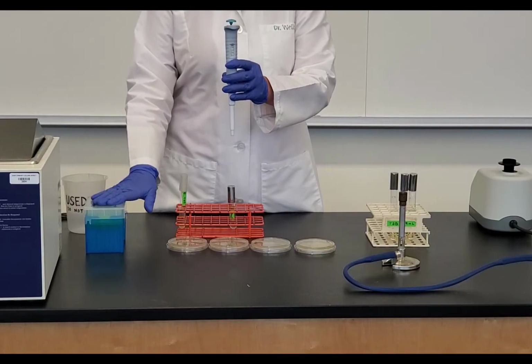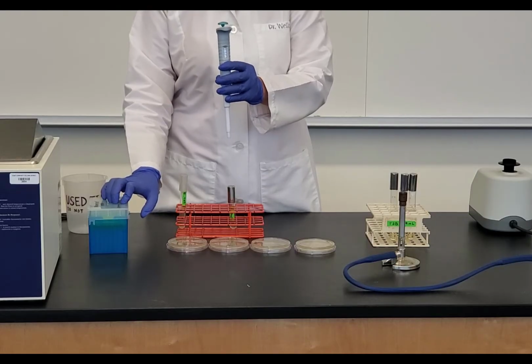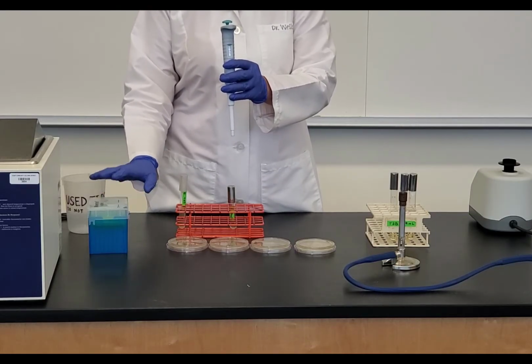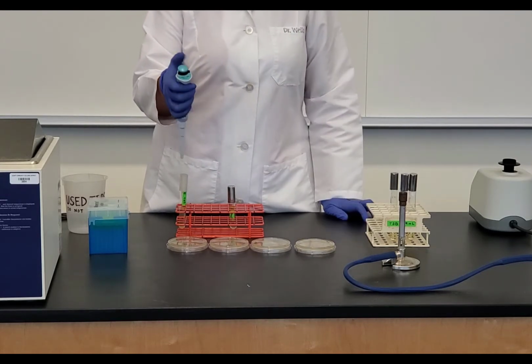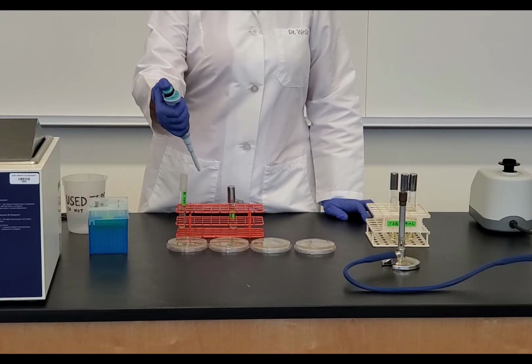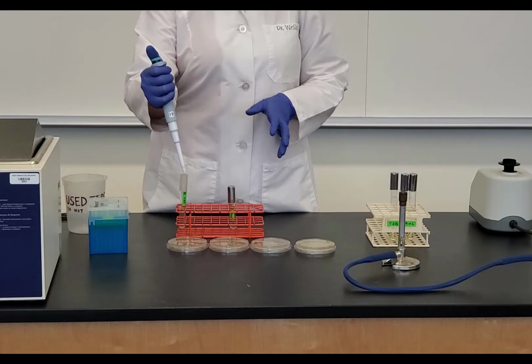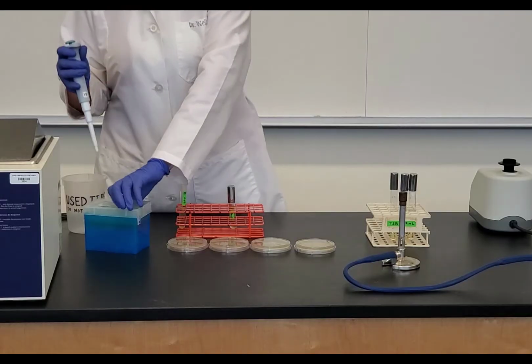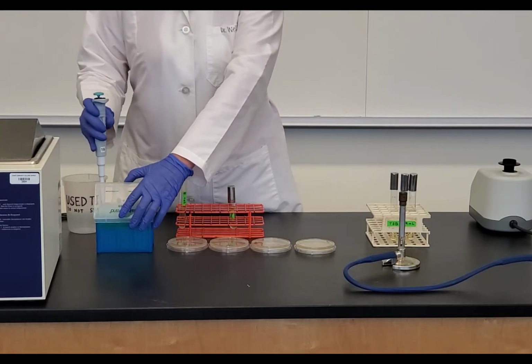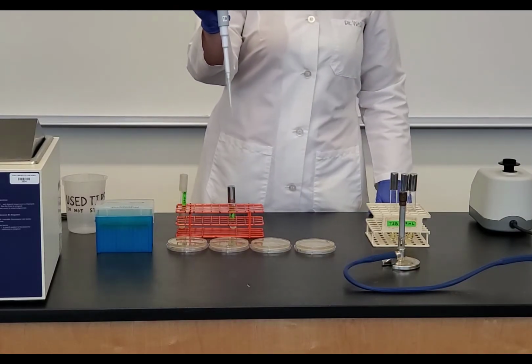Remember that when I do this experiment, I want to keep these tip boxes closed as much as possible. I only want to open them when I go in to grab a tip. So I keep this closed as long as possible to keep these sterile. Now, remember that when we use our micropipetters, here is the plunger, and our plunger has a first stop and a second stop. Remember that the only time that we go to the second stop is our blowout phase, when we're trying to get all of the liquid out of our micropipetter. So what I'm going to do is open my tips, and I'm going to get a tip on my micropipetter. So now I have my pipette tip.